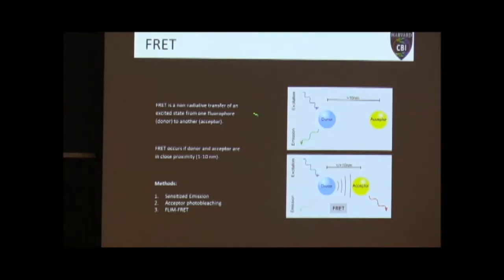Okay, so let's just talk real quickly about FRET. I feel this is something that most people are familiar with, judging by the number of people that ask me about it. But what people aren't familiar with or haven't heard of are the pitfalls of FRET. And there are a lot of pitfalls of FRET. So just a quick review of what FRET is. It's a transfer of energy from a donor fluorophore to an acceptor fluorophore.